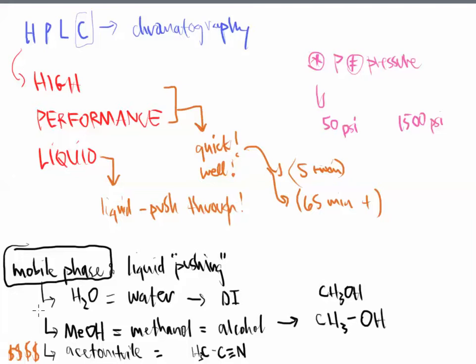We use it ourselves for the labs in our program, and you're more than welcome to use it for your research project. So it is supported, but keep in mind that more acetonitrile means a more expensive method and a more expensive research project to run. But we do have it and we do use it. Don't feel ashamed if you find something that requires it. It's okay. So this is the story with the mobile phases.